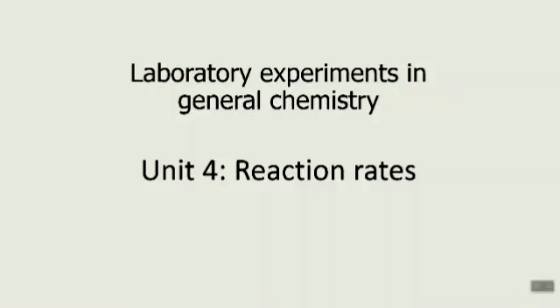Welcome to Laboratory Experiments in General Chemistry. Today we study Unit 4, Reaction Rates.